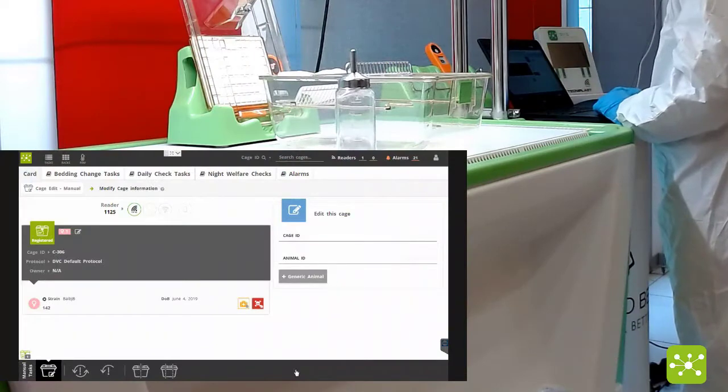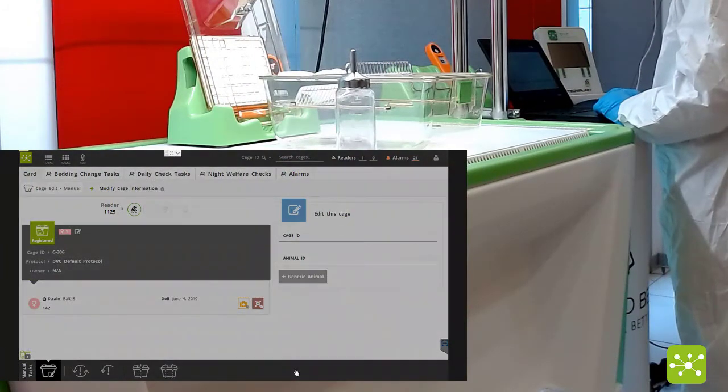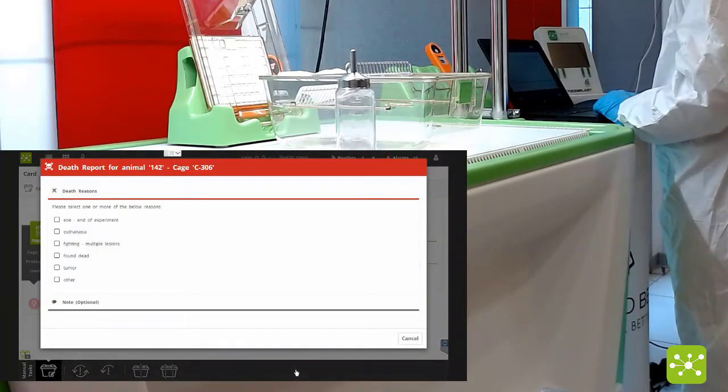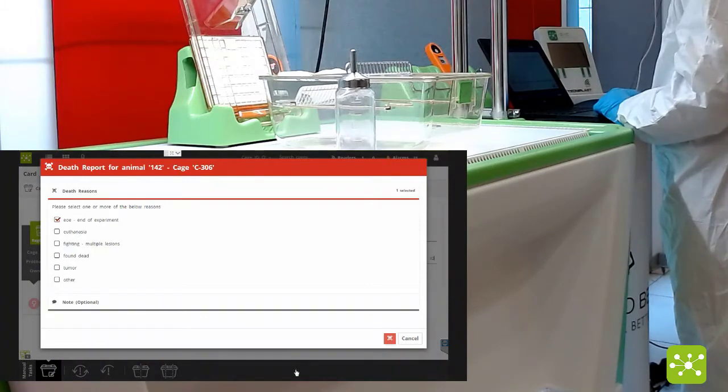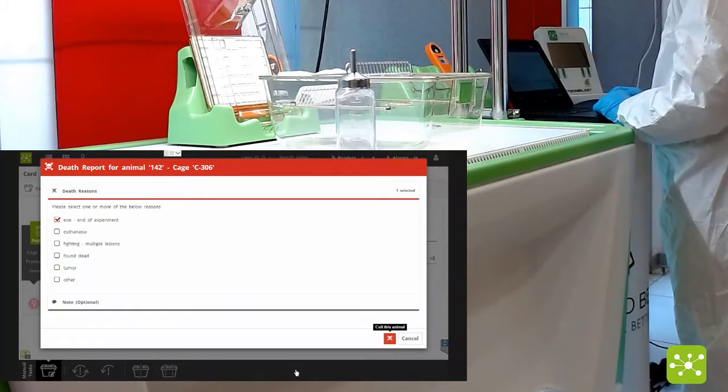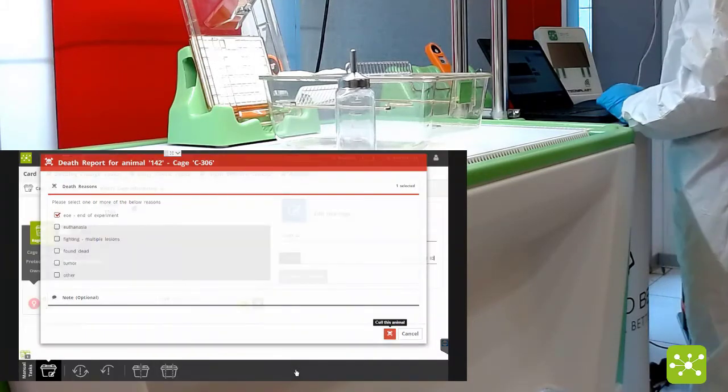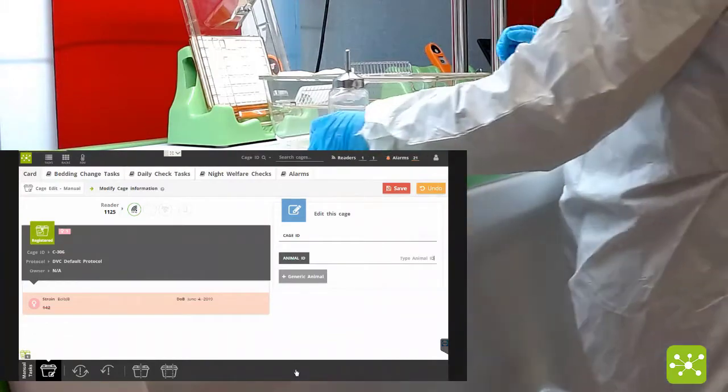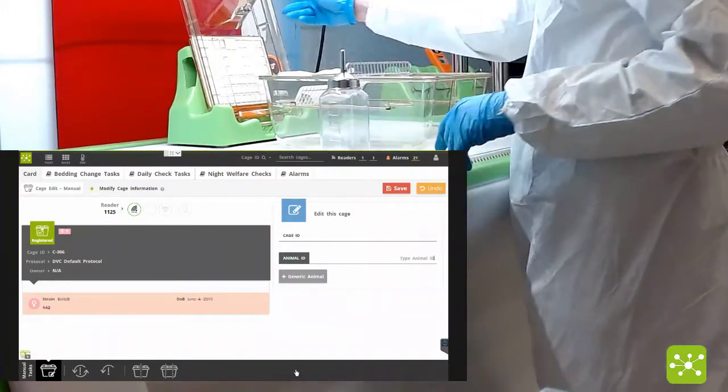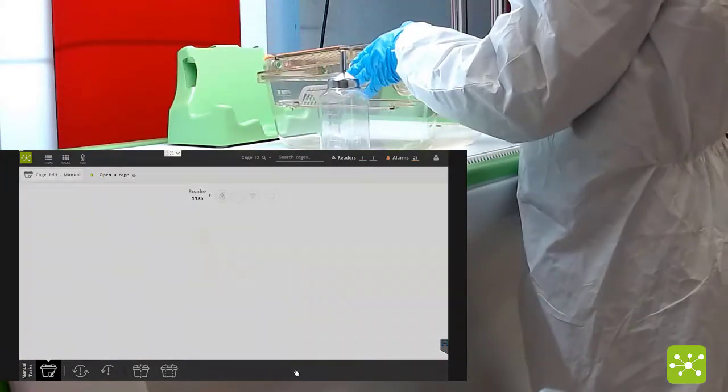The cage appears in the interface. Now you can click on the animal you want to eliminate, provide a valid death reason or cull reason, click on the corresponding button and the animal is eliminated.